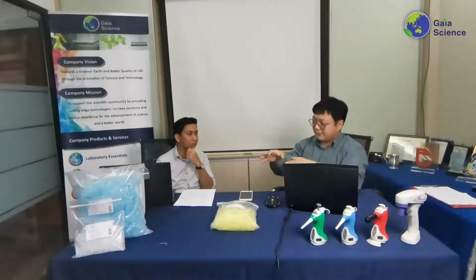Because when the manufacturer does the manufacturing and puts it into the rack already, they have tested it and confirmed that if you use it as is, you will get the exact amount. But when you buy bulk, again, you have to remember, I could be shaking it around, not throwing it around. And then you autoclave it as well, right? So the autoclaving is again done at your own risk and not done by the manufacturer's specs. So the quality of it might be affected, and you might see changes that you might not catch until later on. So that's the first reason why autoclaving it on your own might not be advisable compared to racking.